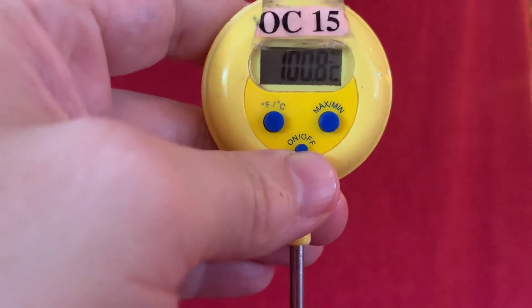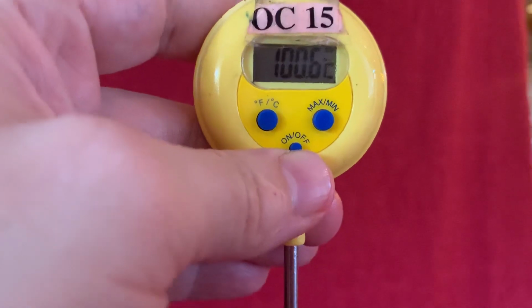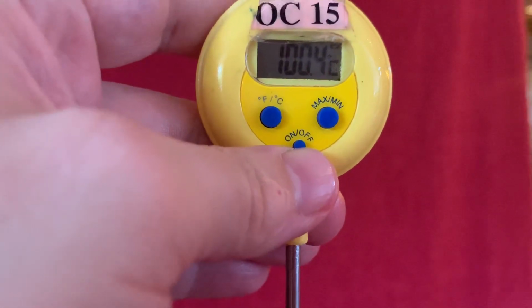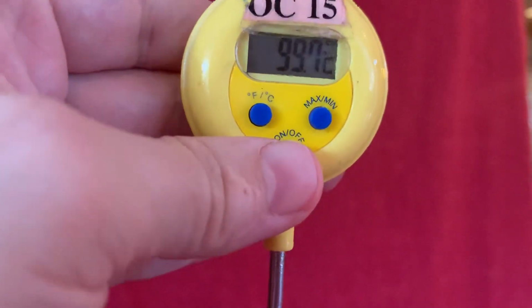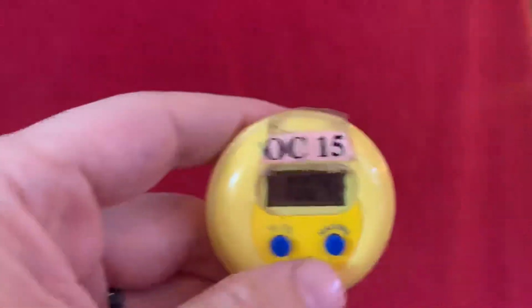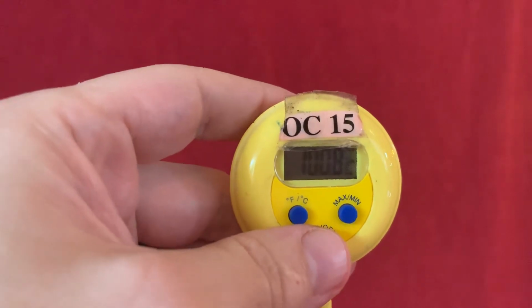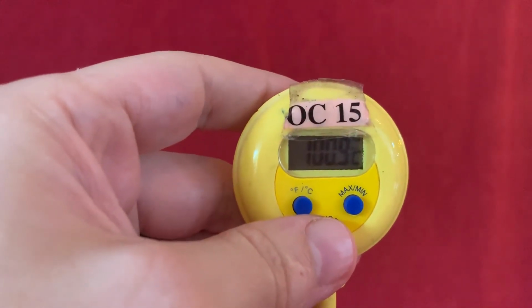See that this thermometer seems to be telling us that our boiling water is approximately, not settling down to a single temperature. There we go.